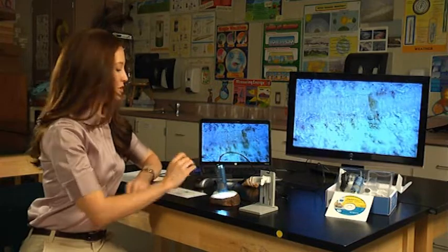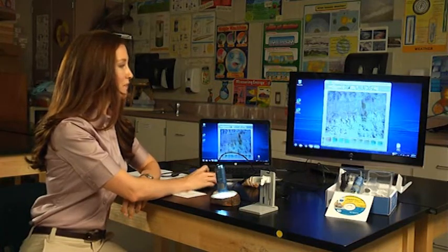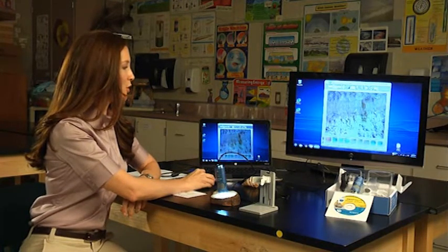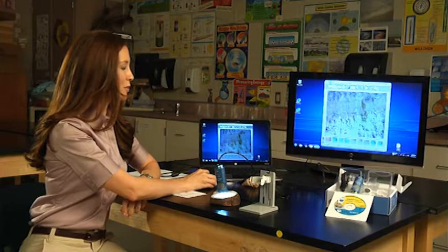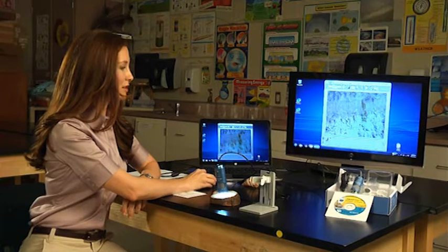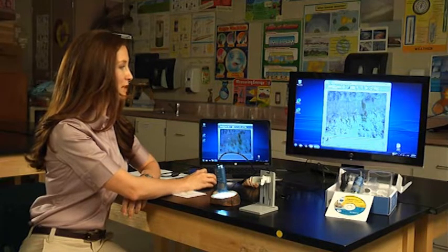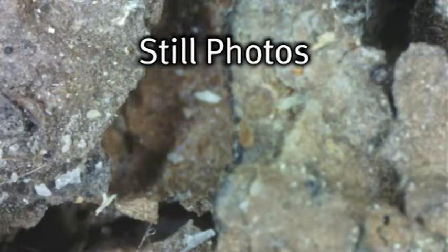If you want to take a look at the images, you just double click. And then you can scroll over right here at the bottom to view all of your images. And there's the last image we took. Just pick it up and drag it. And there you go.